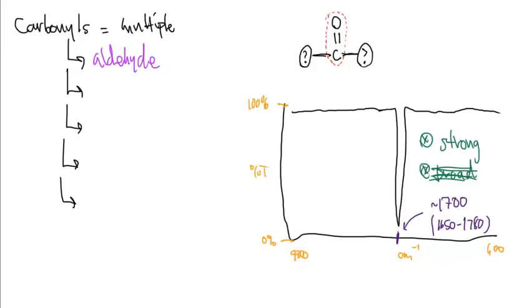And if so, that's okay. But in the previous video, we said the carbonyl has to be here, and depending on what's on the sides, this will determine what type of molecule that I have. All right, well, finally, we get to maybe erase these things and really talk about what's on the side here.